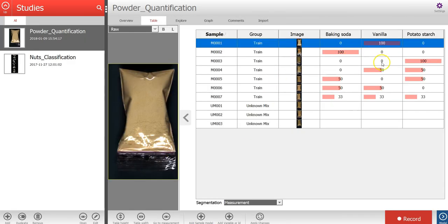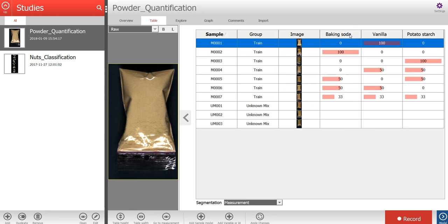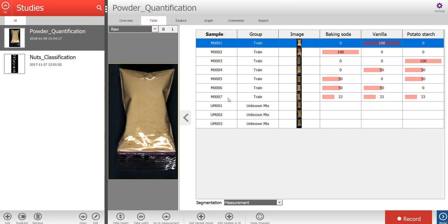In the table, columns and values have now been added for the three properties, which corresponds to the percentage of each powder type for these training samples. And the values are matched to the correct sample based on the name in the sample column, which we also had in the spreadsheet.